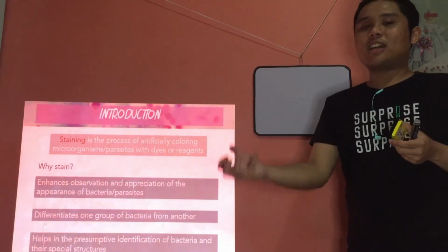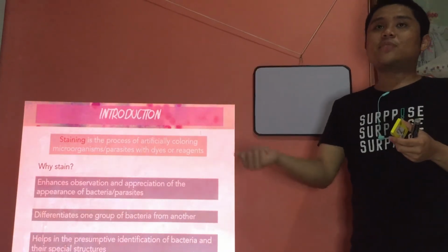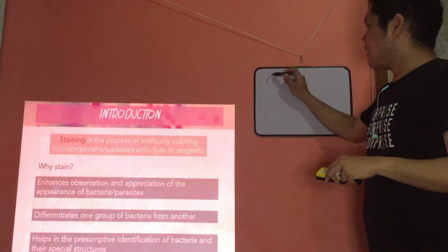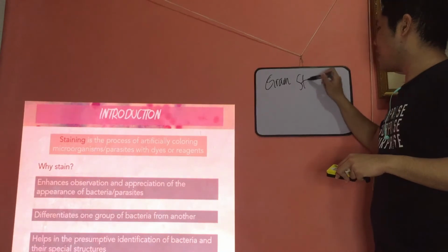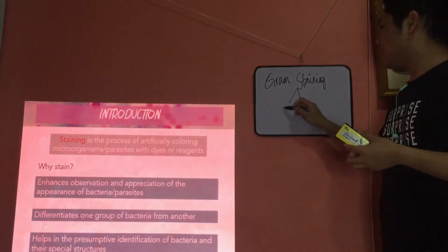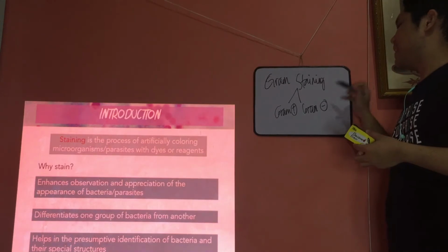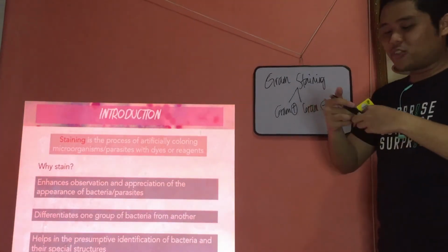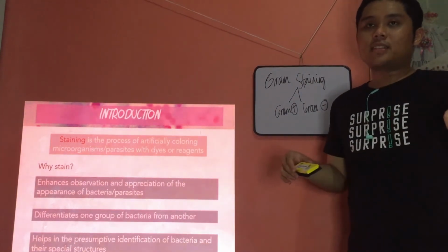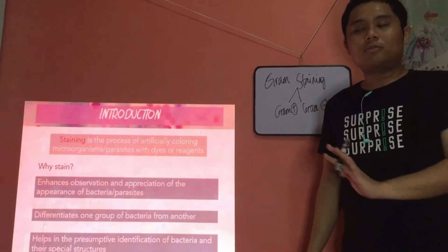It is established as one of the cornerstones of identifying bacteria in bacteriology: the Gram staining, right? I think Ma'am Teddy will explain the procedure and the principle of that. Because again, it divides the bacteria into gram-positive and gram-negative. And through that, once you already know that this bacteria that I isolated from this specimen is gram-positive, these are the tests that I need to perform.